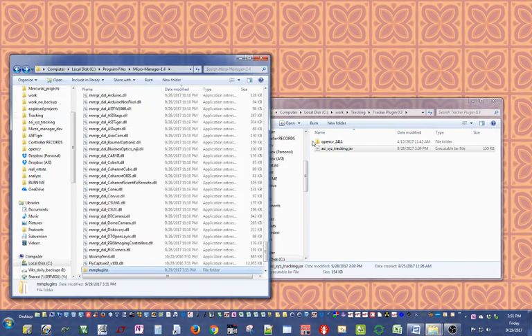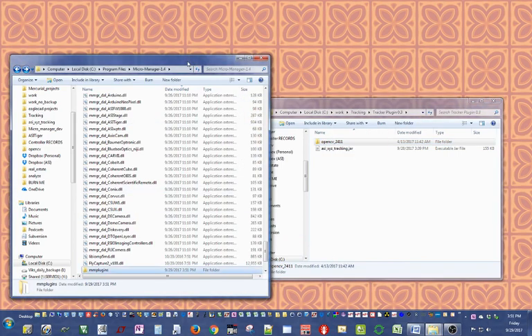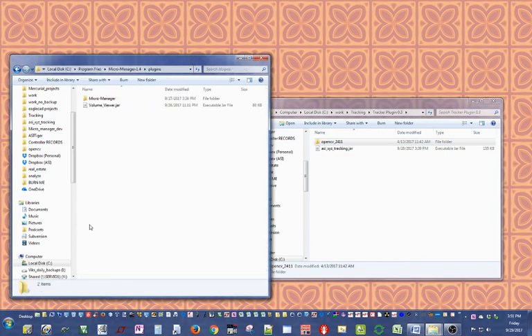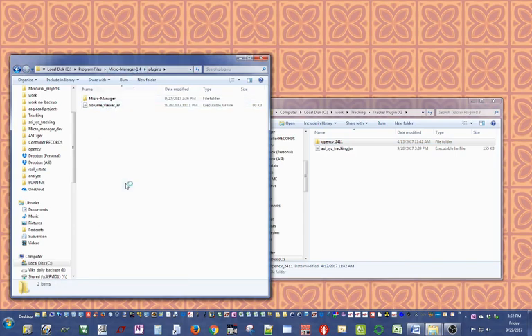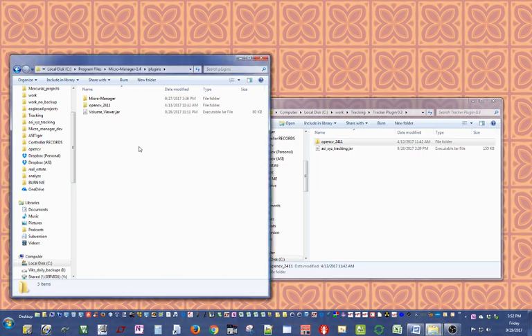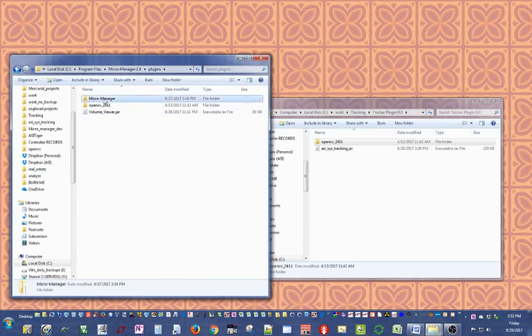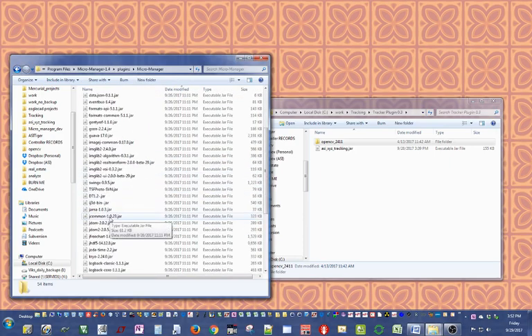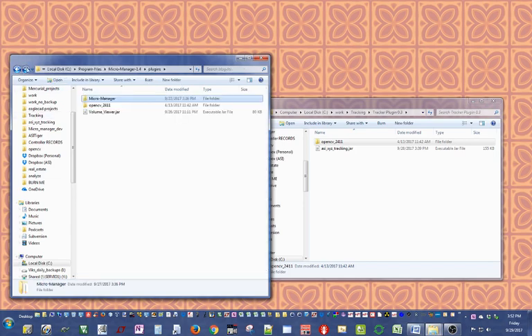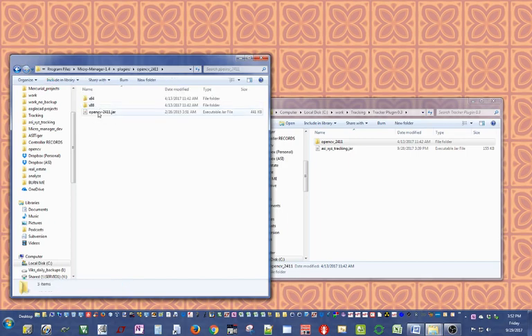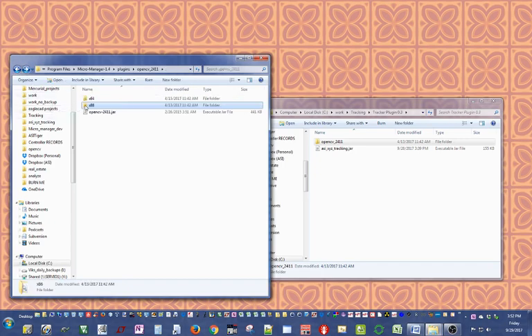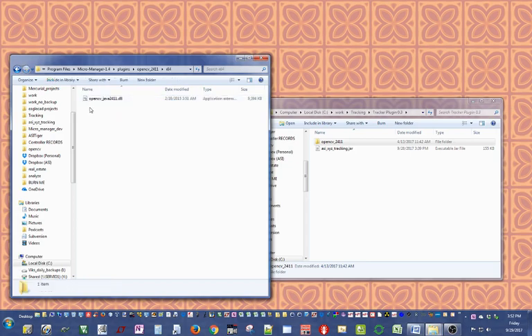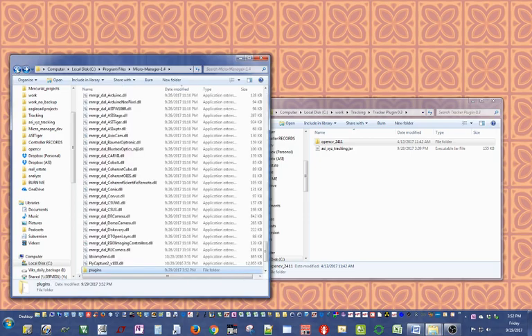Next we need to copy the OpenCV library into the plugin folder in MicroManager. This folder holds some of the libraries that MicroManager needs to work. Put OpenCV 2.4.11 here. This folder basically has OpenCV jar and the DLL for the 32-bit version of the operating system and the DLL for the 64-bit version. The plugin is smart enough to figure out what version of the operating system you have and use the proper DLL.